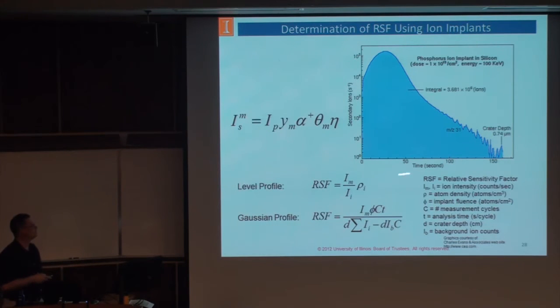The key here to point out is we're always talking about a ratio of the counts between the impurity or the dopant atom and the matrix. So if you just showed me counts from your dopant and from two films and said, see, it's bigger here, I'm like, well, what's it ratioed to? By doing the ratio, it also gets rid of some instrument effects.